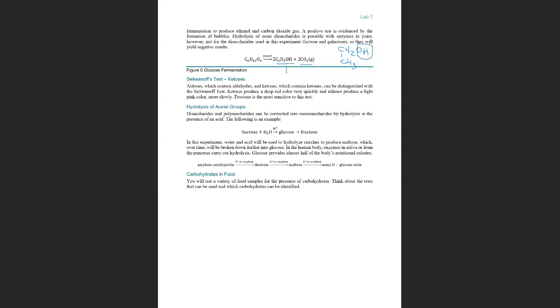First, there is a hydrolyzation using some yeast or enzymes, and then you obtain glucose. And then the glucose is used in brewing a beverage and cereals. So first they hydrolyze the barley, and then what happens? Once you have the glucose, they undergo fermentation to obtain the ethanol and the carbon dioxide. But for us, the only objective in order to know if we are in the presence of fermentation is to look for bubbles.